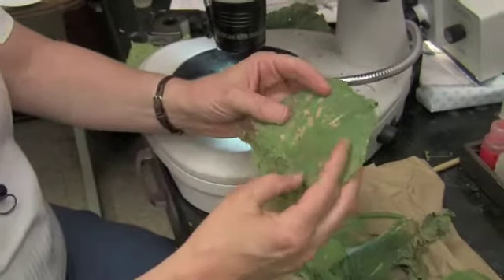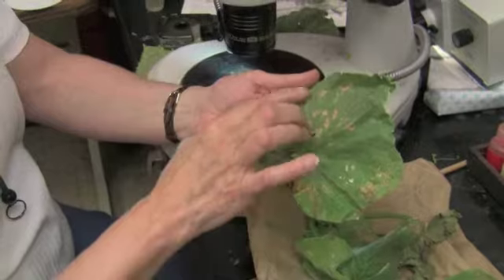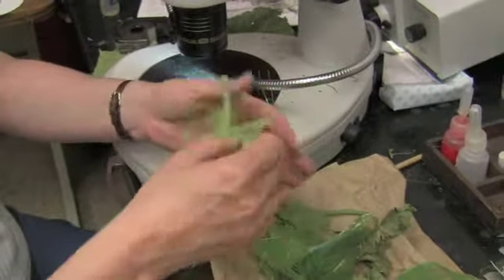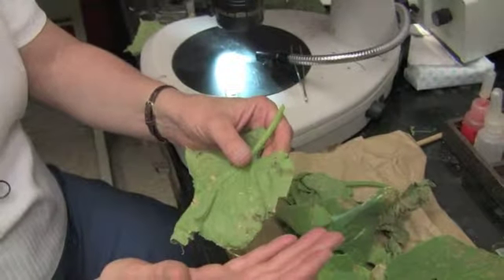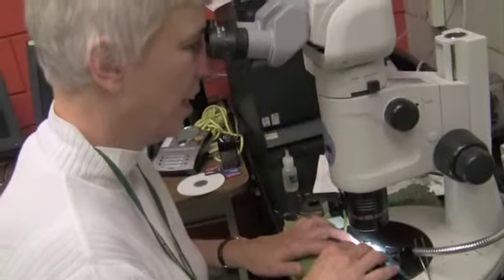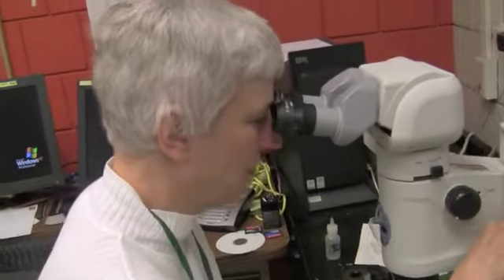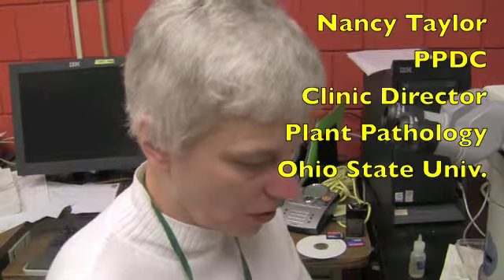So Bob, what we're looking at here are the leaf spots on this cucumber sample that you've brought in, and I'm looking for fungal spores which will allow me to identify specifically what is causing this problem. Looking at it microscopically, we've examined it for bacterial diseases, and now we're looking for fungi, and right now I'm not finding any obvious fungi on these leaves.